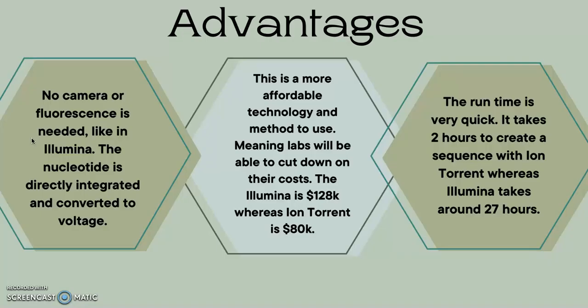With what seems to be so many limitations, why would you want to pick this over something else like Illumina? Well, one advantage is that it's a direct system. There is no need for a camera or fluorescent labels. The nucleotide is directly integrated and converted to voltage. This means sequencing is occurring in real time.